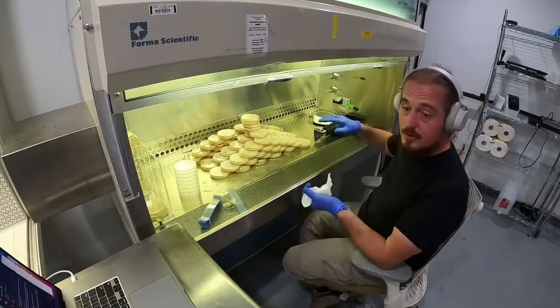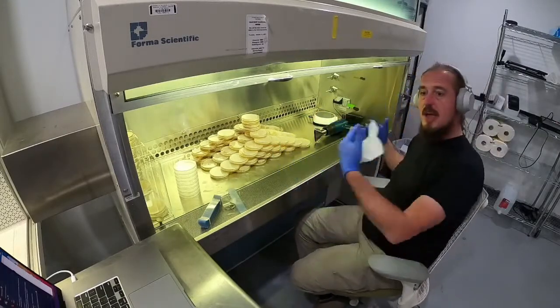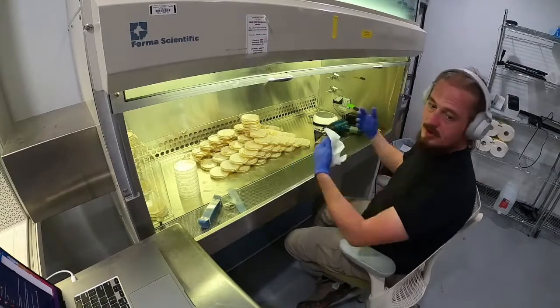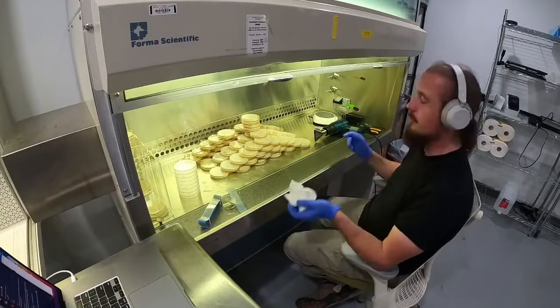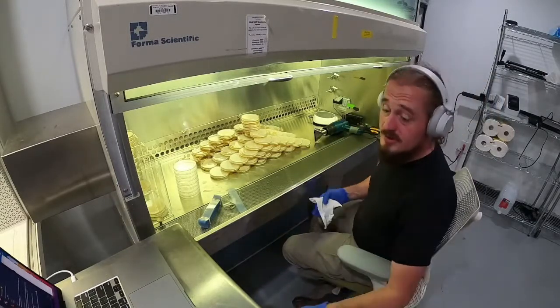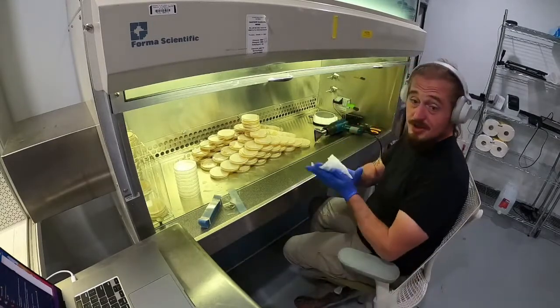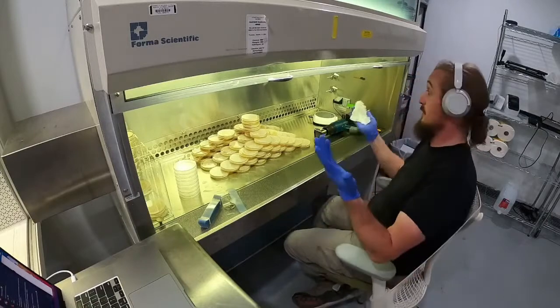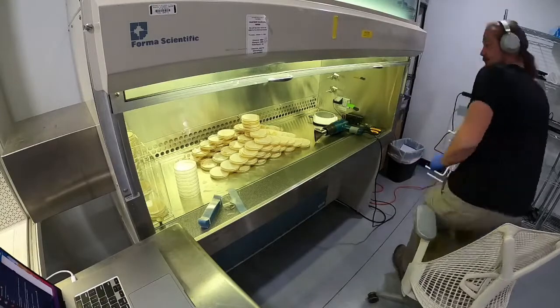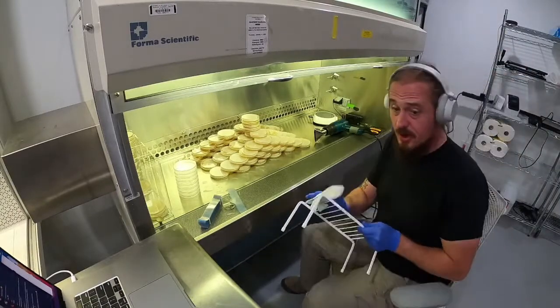All you've got to do is remember, if you're trying to keep a sterile workspace, everything that goes into the sterile zone has to be sterilized. Everything coming out of the zone, it's not sterile anymore, right? So the heat gun, all you have to do is put it into sterile airflow, and then that hot little bugger just starts blowing hot air, and you're off to the races. Now, this particular heat gun actually has an attachment on it.